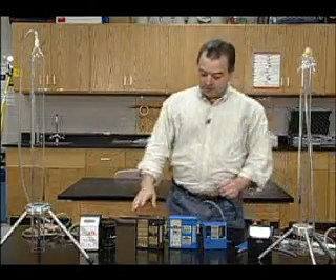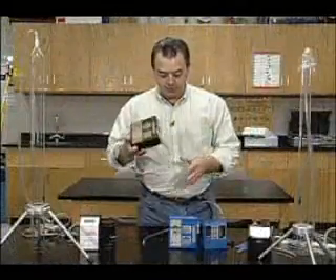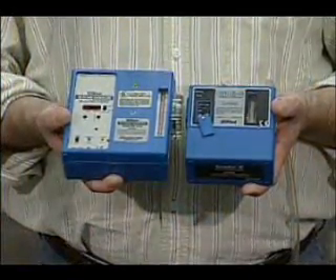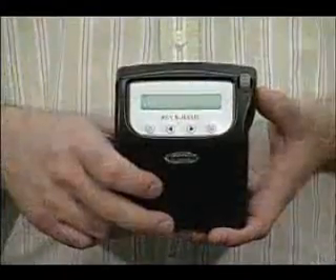Let me talk about different types of pumps. We have an SKC pump — this is probably the heaviest pump, one of the most durable. Then we have a Gillian high flow pump and a Gillian personal flow pump. And then last but not least is the buck pump.